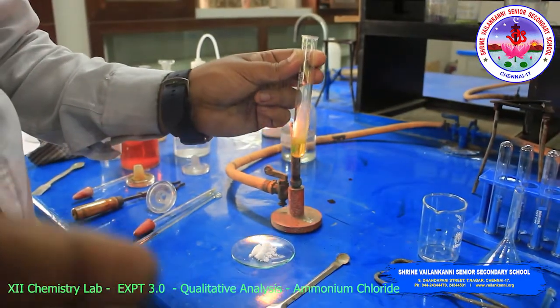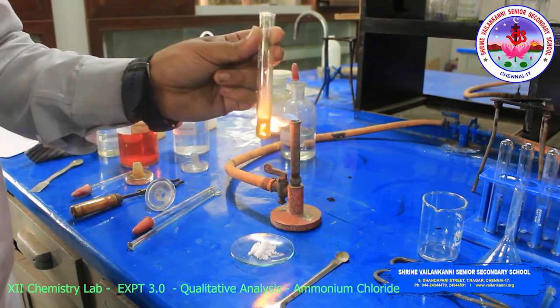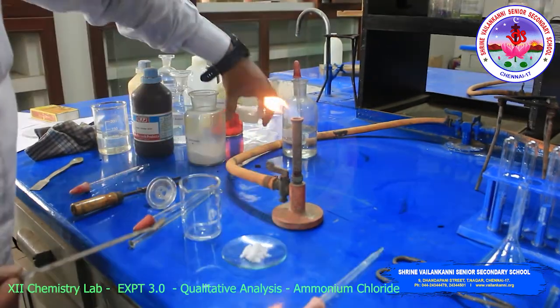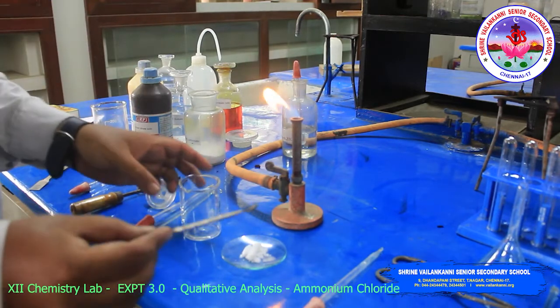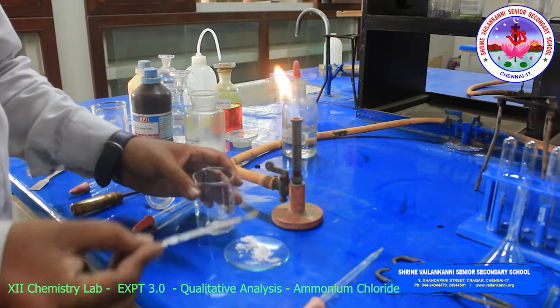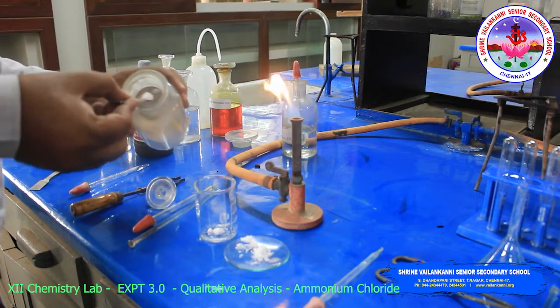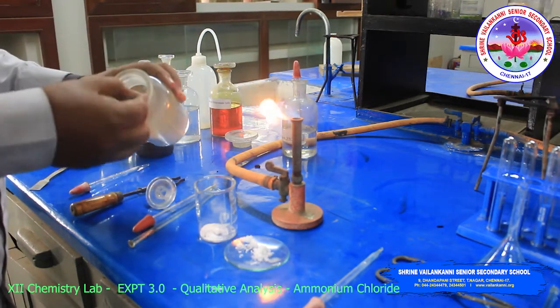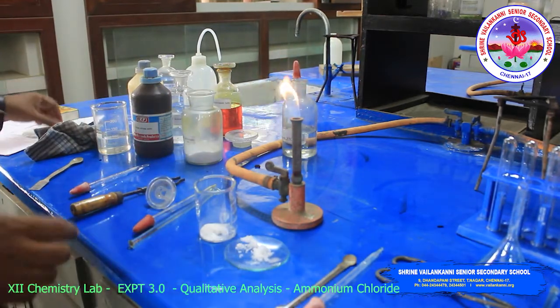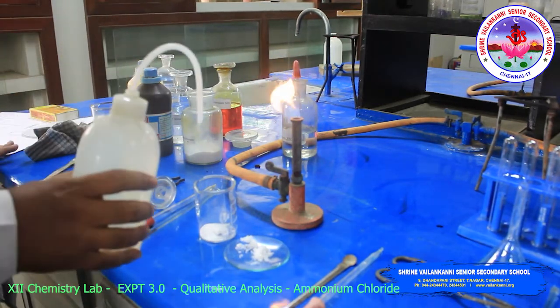So the acid radical is what? Chloride. Now one more test we will do, that is the silver nitrate test. Preparation of sodium carbonate extract, then we will do the test. Now preparation of sodium carbonate extract: a small amount of substance is added, then twice the amount of sodium carbonate is added. So this is twice the amount. Then add water and dissolve it.